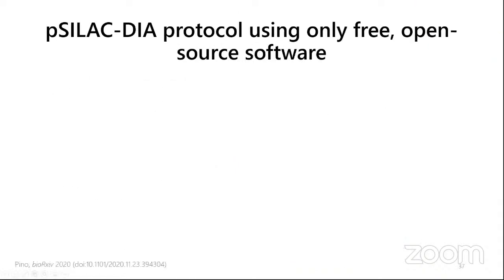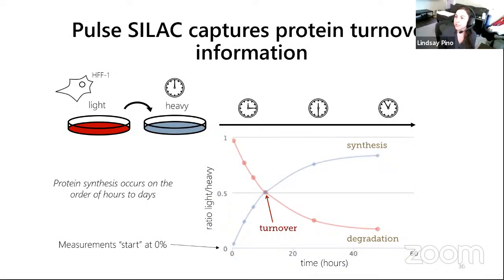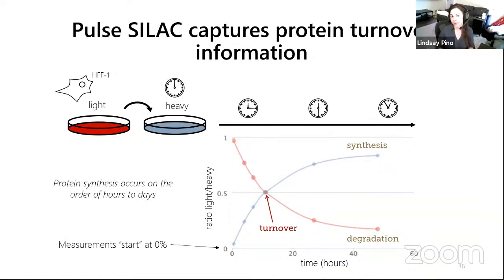Lindsay, there's a technical question. Are these time scales, for example in terms of hours, typical of protein turnover? Yes. These time scales, between hours to days, are typical of protein expression. Every protein is a little different. And honestly, every proteoform is a little different. We'll talk a little bit about getting at that proteoform question in just a bit.